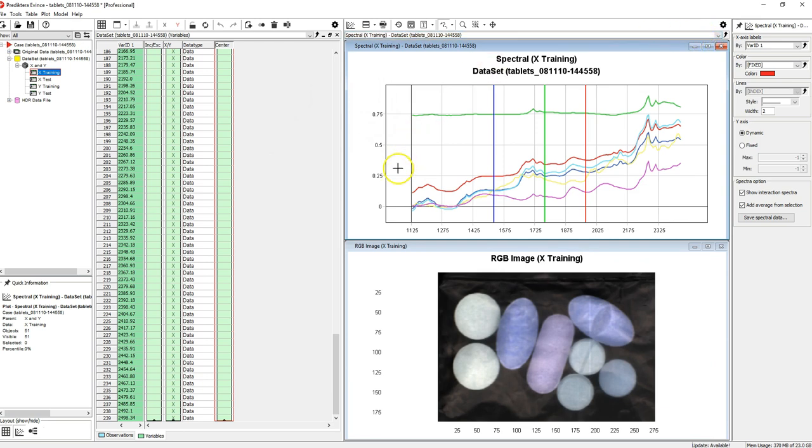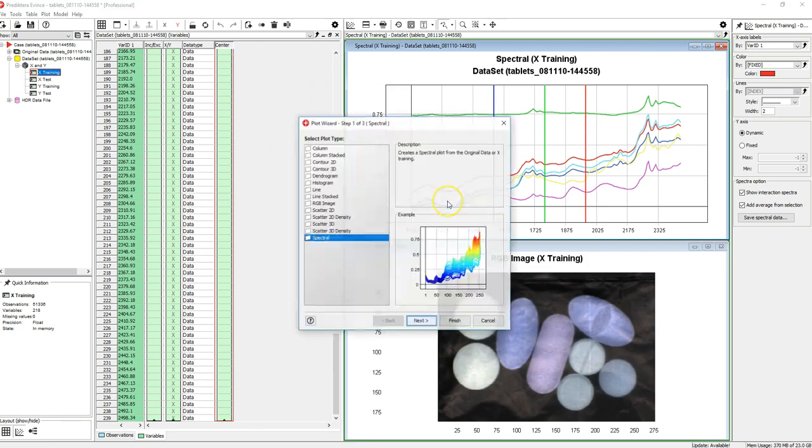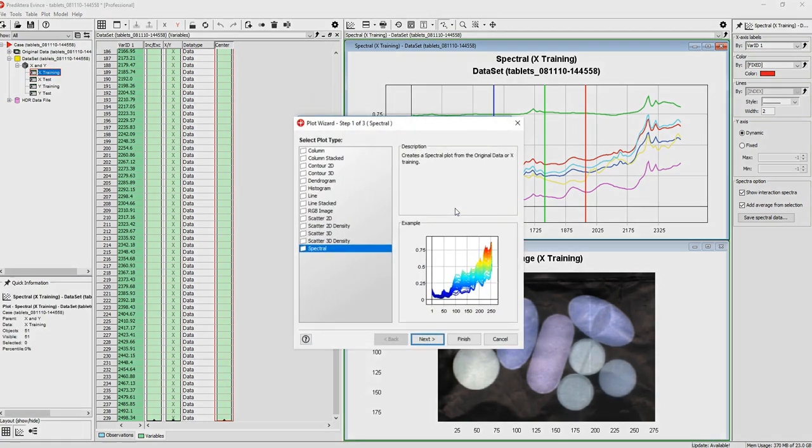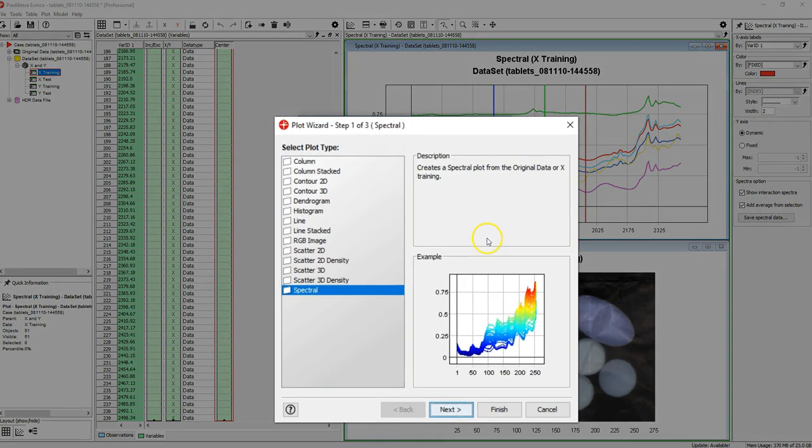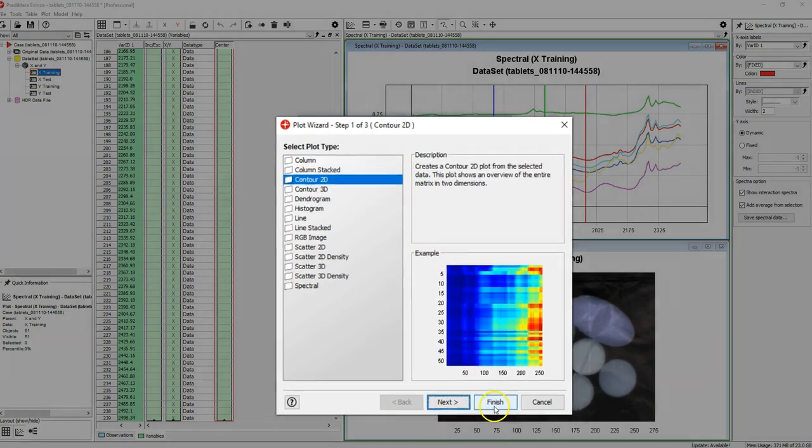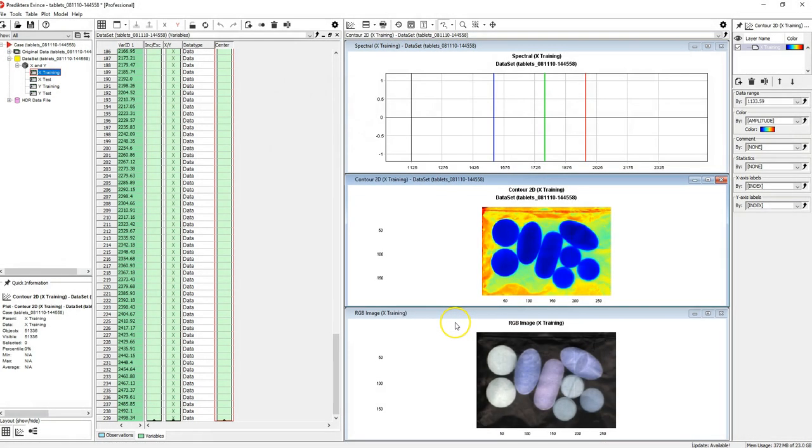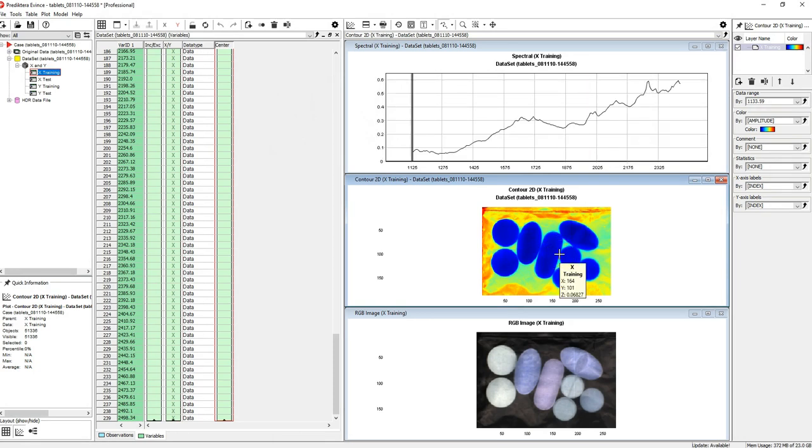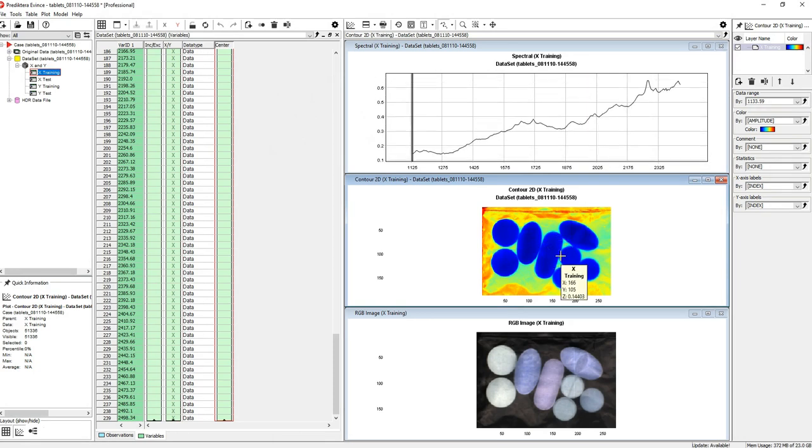Drag and drop the X training again from the data tree. This time let's select to generate a contour 2D plot. The coloring here is based on the intensity of a single wavelength.